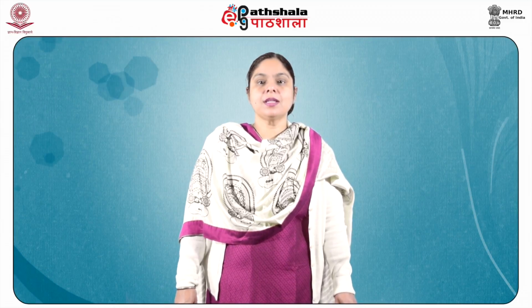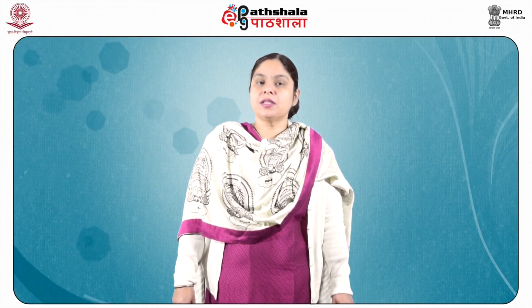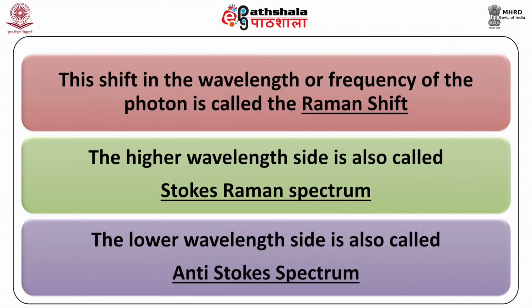So when photons are scattered from an atom or a molecule, although most of the photons are scattered elastically, which is the Rayleigh scattering, a small fraction of the scattered photons are scattered by excitation, with the scattered photons having frequency or wavelength different from the incident photon, thus either higher or lower than that. So this shift in the wavelength or frequency of the photon is what we call the Raman shift. The higher wavelength side is called the Stokes-Raman spectrum, while the lower wavelength side is called the anti-Stokes-Raman spectrum.